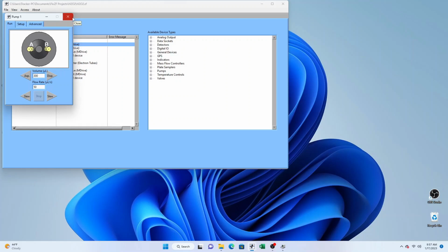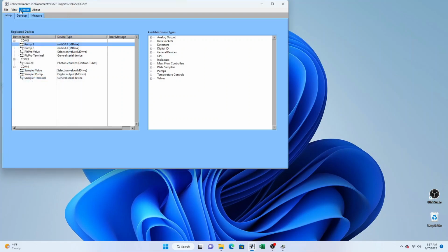It's also handy to have a number of these manual controls up at any one time, and so if you open up the panels where you want them and place them on the screen, and then go to the view menu option and record that view, it will record the position of those panels.